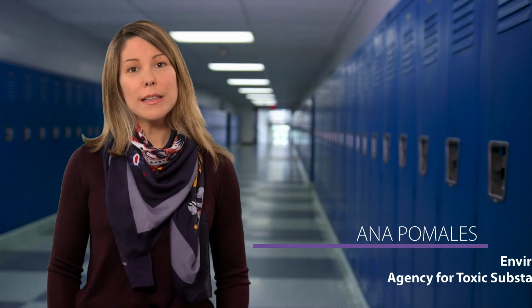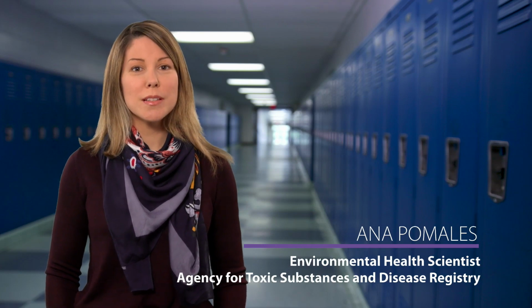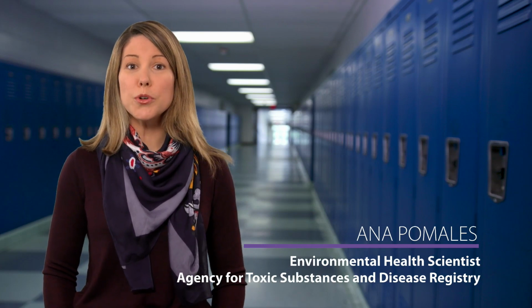Now that you know about elemental mercury, its risks, how to prepare your school for a mercury spill, and how to quickly and effectively respond to and clean up a spill, let's see how well you remember some of the most important points that you learned. We have a quiz with 3 multiple-choice questions. Answer each question and we will review the correct answers together. Okay, let's begin.